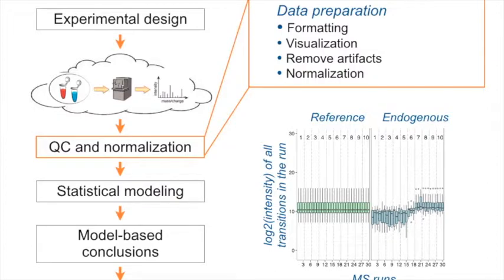I'm just trying to ask a question in shotgun proteomics. Assuming that the number of proteins that differ between two conditions is small, and because I've been using the coefficient of variation for each protein between conditions, just to get an assessment of how different they are, so the variation between all the proteins. Is that a possible way of assessing how good the normalization is? Because you would get a distribution of coefficients of variation.